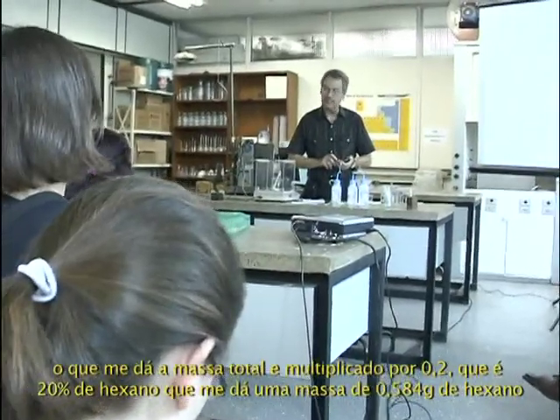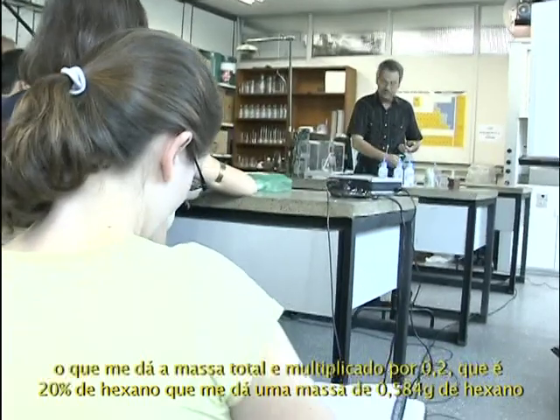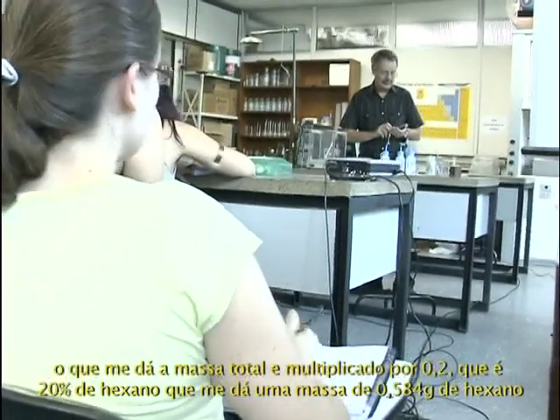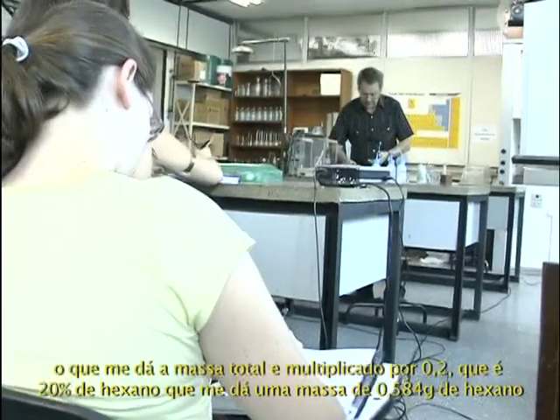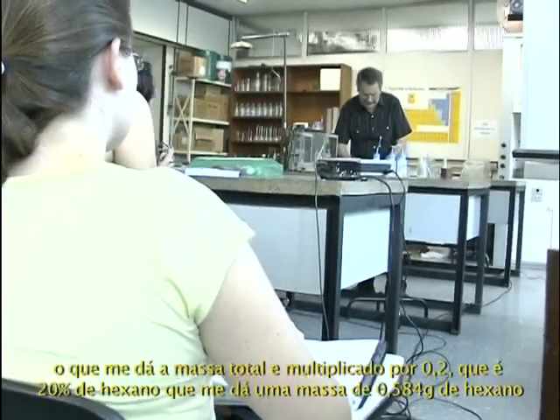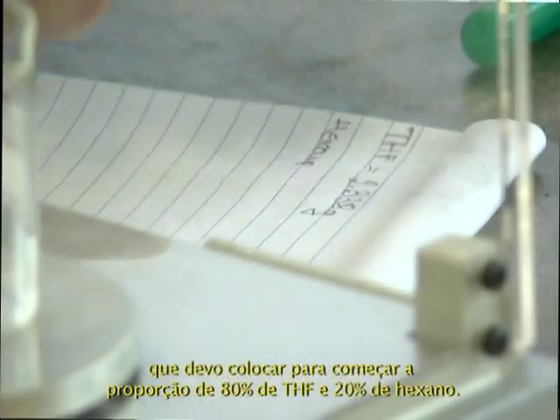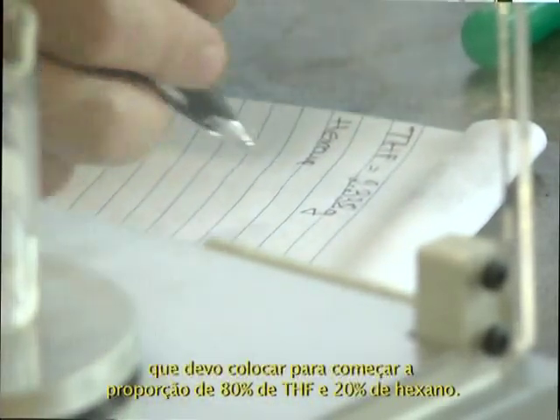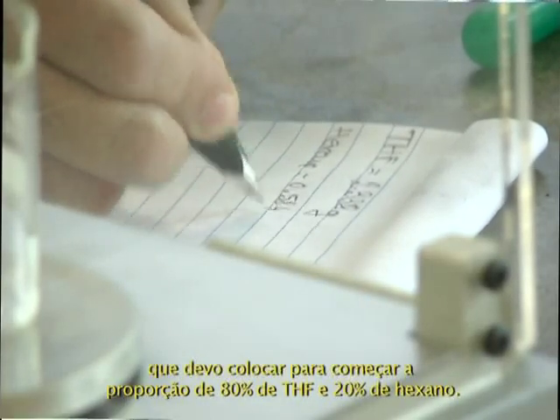That gives me the total mass, and I multiply by 0.2, which is 20% of hexane, and that gives me 0.584 mass of hexane I should put in to start with the 80% THF, 20% hexane proportion, 0.584 gram.